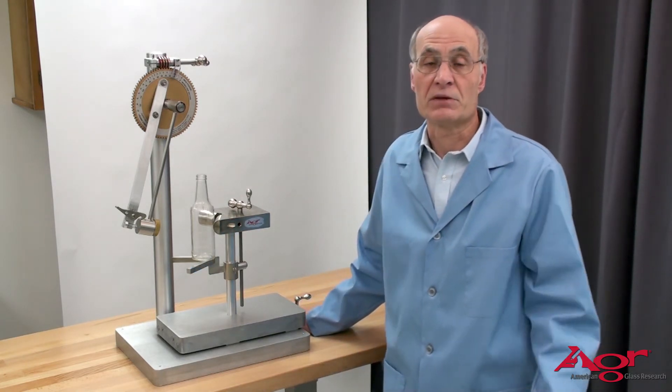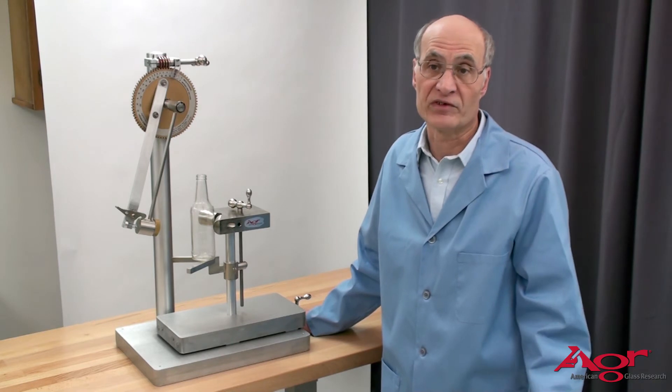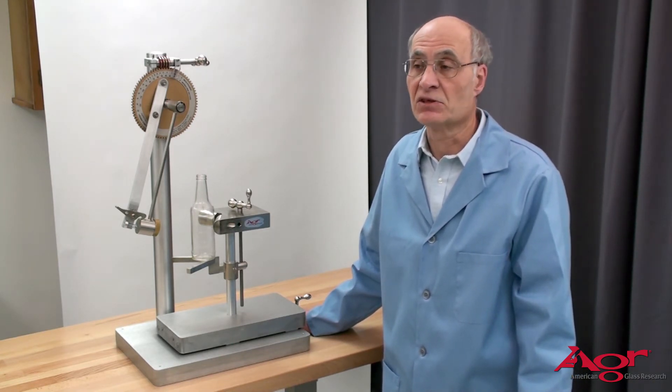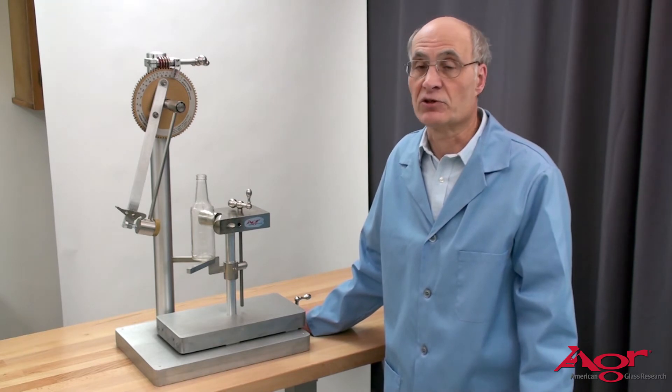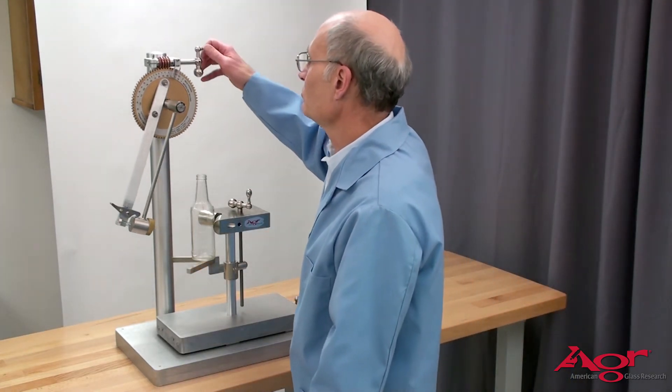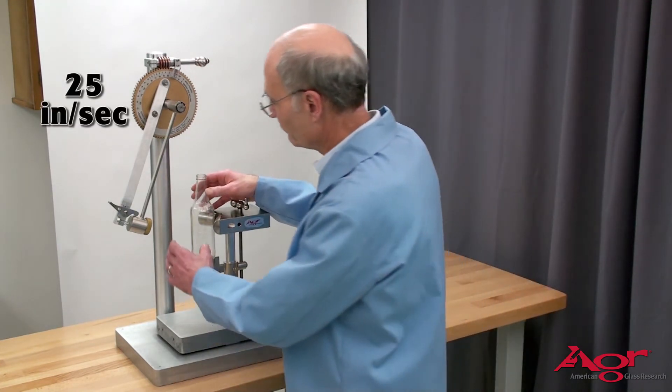Now the type of impact test you can do a progressive test which means you start at a low level and build up until it fails or you can do a one shot deal which would be like a pass test. For most of our testing here we're going to do a progressive test just to demonstrate it. So I have the bottle positioned. We'll start at a level of 25 inches per second which should be well below the breaking level.